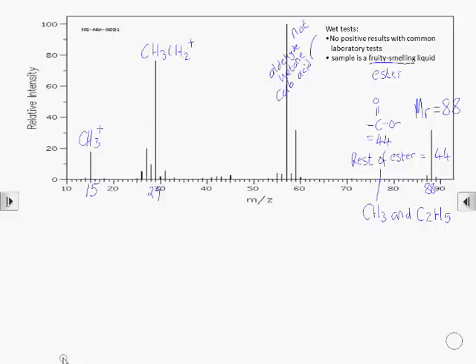We'll have to work out some of the larger fragments. We could combine the ester and the methyl, so that would be CH3COO. But we could also have the methyl group on the other side of the ester, so we might have C double bond O, OCH3. That's the same atoms, so it's going to be the same mass—44 for the ester group and 15 for the methyl.